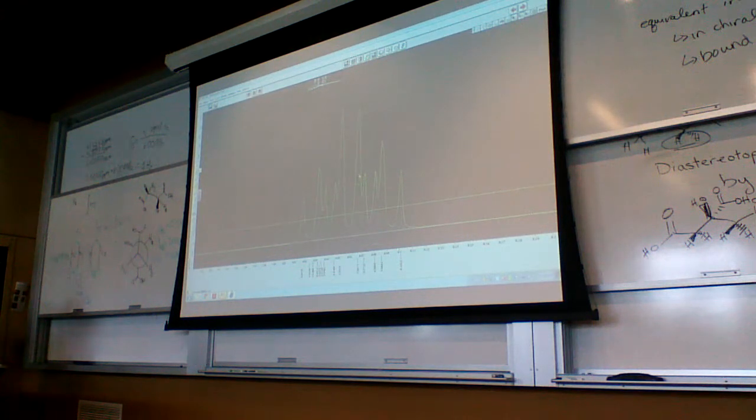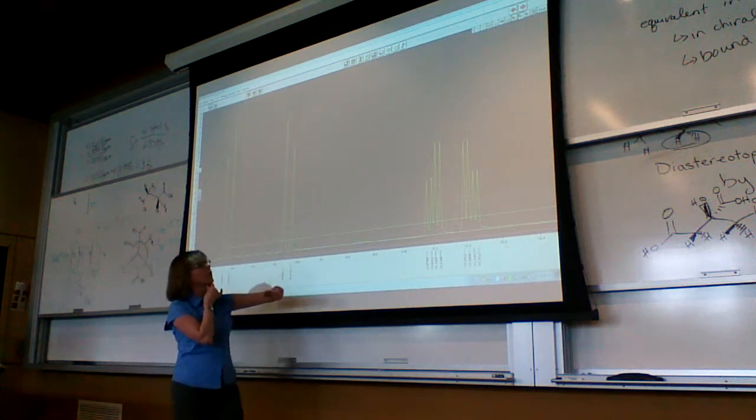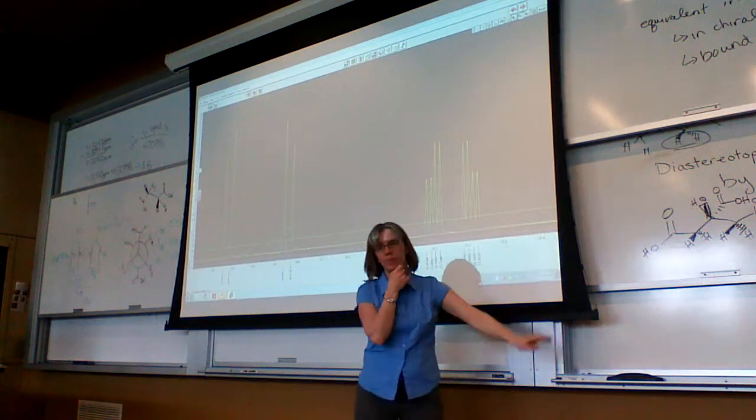Some of these get rather complicated. Once you've decided you like some of the values you found, you may want to check with another peak in the spectrum. Remember that another one within the spectrum is going to have the same coupling constants. So let's look down here. We've got 4 peaks here. 1, 1, 1, and 1.